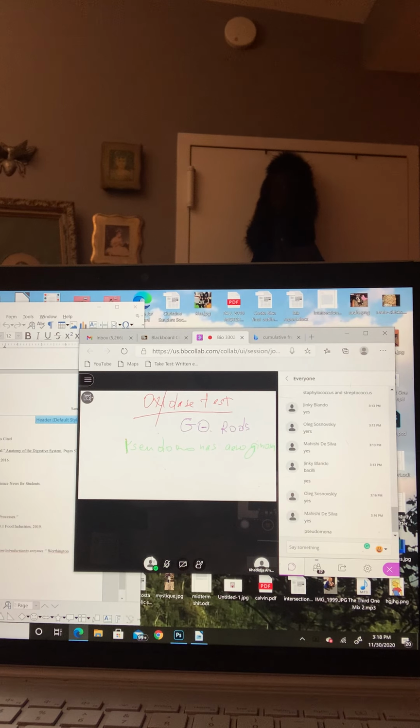So it's oxidase positive. This member of the enterics, which are facultative anaerobes, and the other type of microorganism are oxidase negative, okay, and cannot use the cytochrome C oxidase, that is oxidase negative.